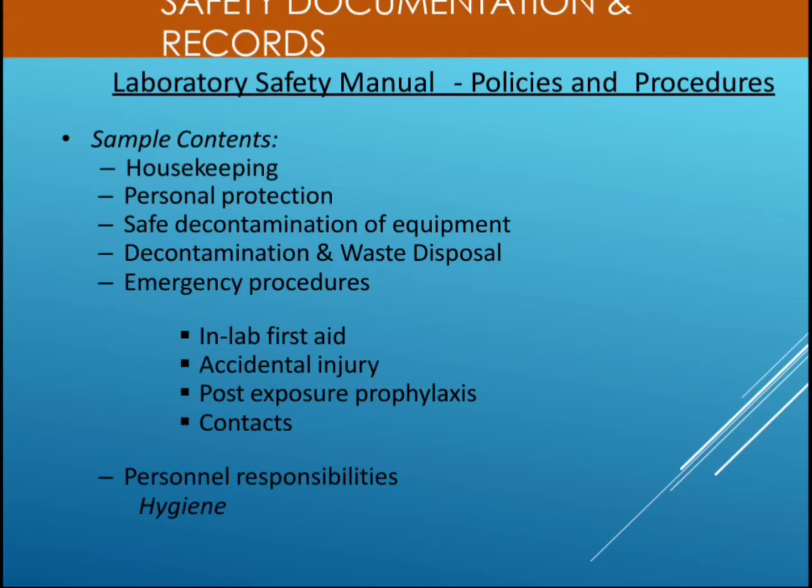Sample components are housekeeping, personal protection, decontamination of equipment, decontamination and waste disposal, then emergency procedures, lab first aid, accidental injuries, post exposure prophylaxis, contacts, and personal responsibilities, that is hygiene. These are the policies and procedures of the laboratory safety manual that have to be documented in the records.